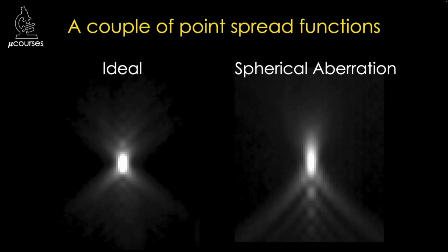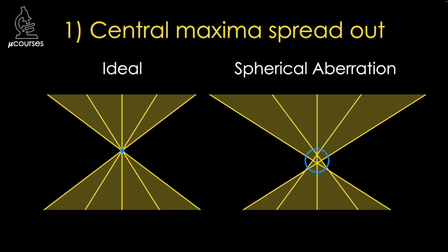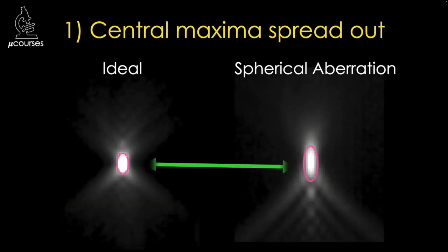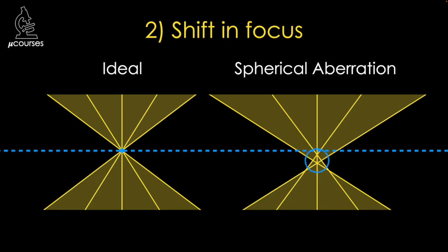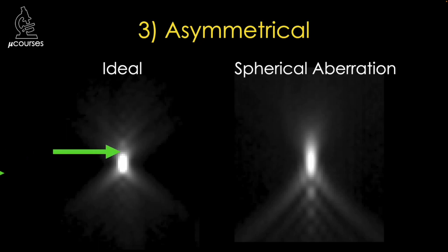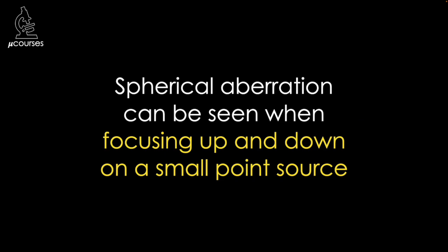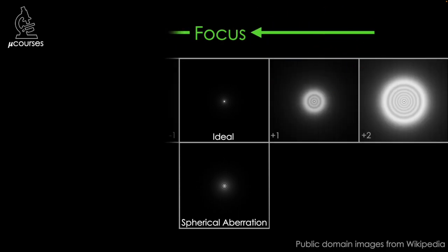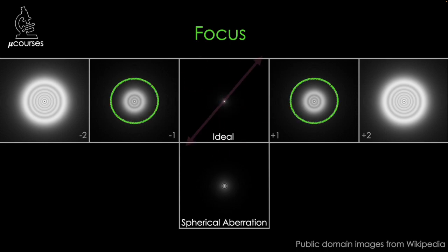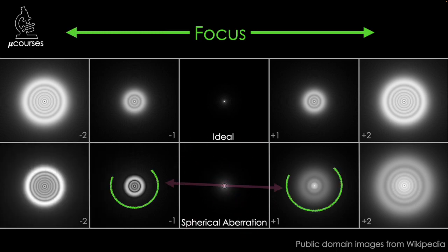Spherical aberration distorts the point spread function away from the ideal in three ways. First, the circle of confusion means that the central maxima of the point spread function is spread out in space. Spherical aberration also shifts the focused image into a different plane. And while an ideal point spread function is symmetrical, spherical aberration results in an asymmetrical point spread function. Spherical aberration can also be identified by focusing up and down on a point source in your specimen. If spherical aberration is present, the asymmetry of the point spread function will be evident.